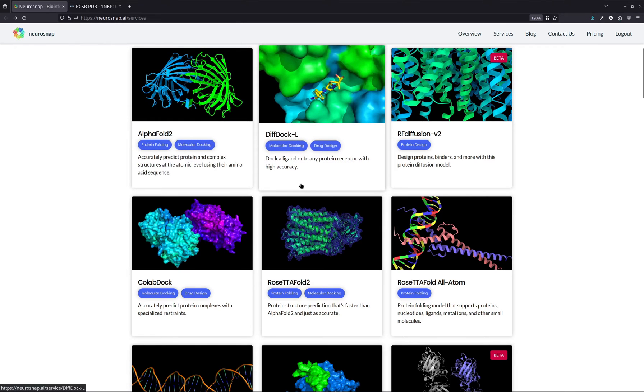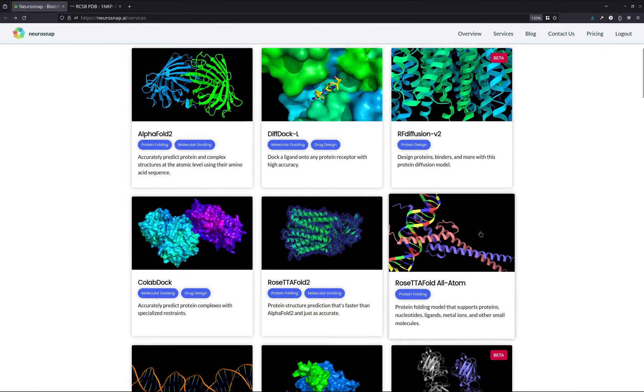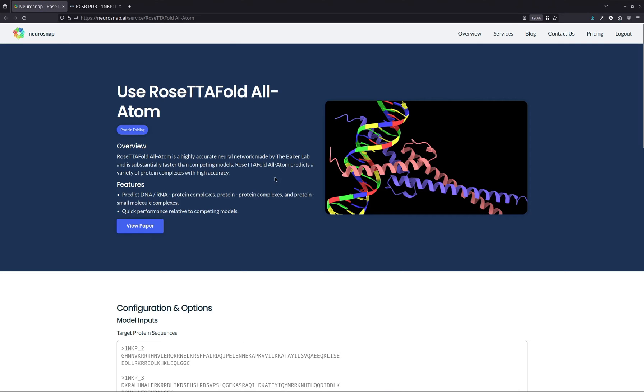So in the case of RosettaFold All Atom, all we're really going to do is select the tool over here. And then from there, we're now at the user submission panel where we can actually enter our inputs on all the different proteins and molecules that we want to fold.